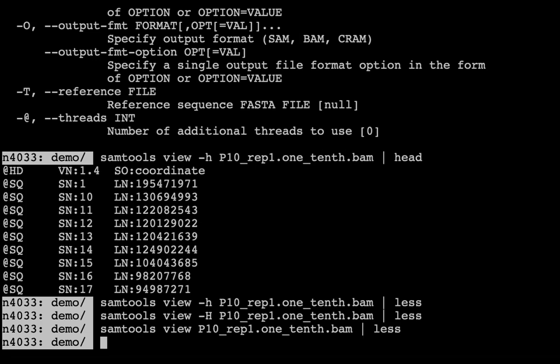So if you Control C, this is a directory. You enter this on the bar. So just copy that location.